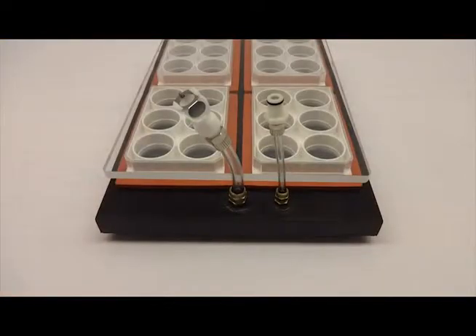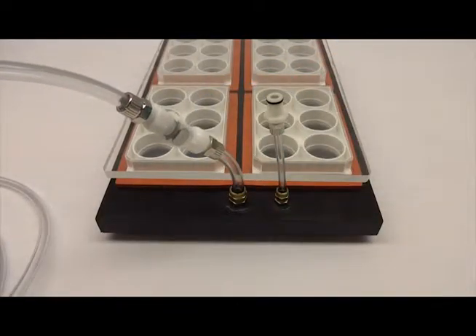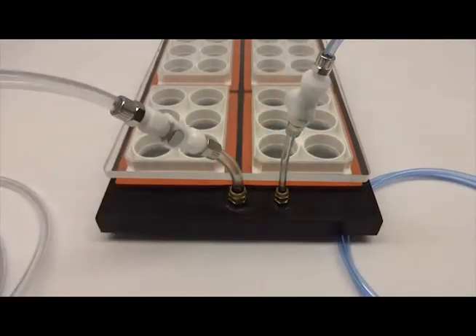Connect the flex in and flex out tubing to the base plate with the quick disconnects. Your base plate is now connected to your flex link.